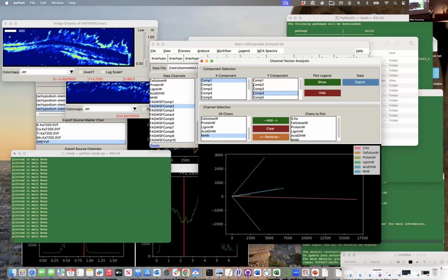This has been critical for the infrared matching, because that's the whole reason why we do infrared: we see totally different features, right? Those hyphae are gorgeous, right? All the organic compounds in that, right? In XRF, it looks like it's a little bit of potassium, a little bit of sulfur in there, maybe, right? So there's a vast chemical difference in the image as a whole.